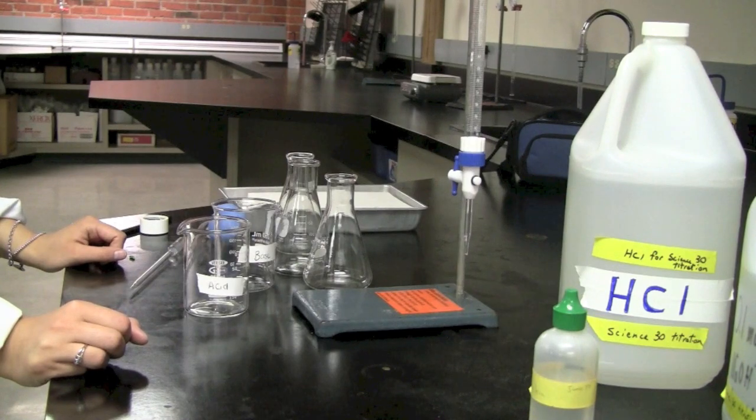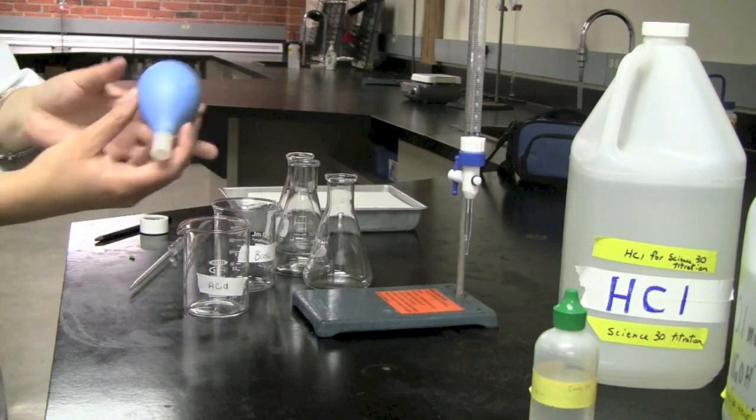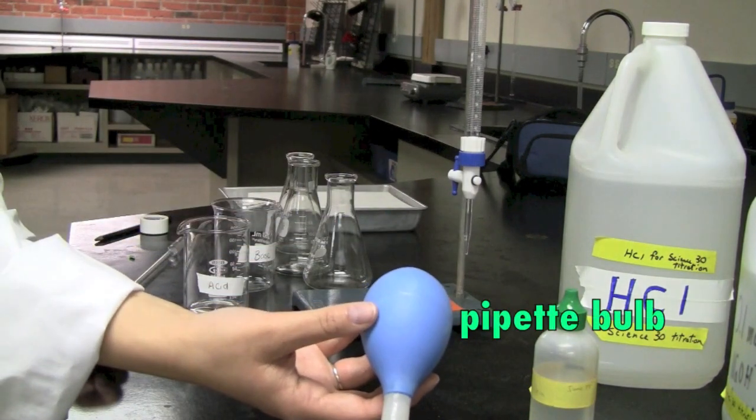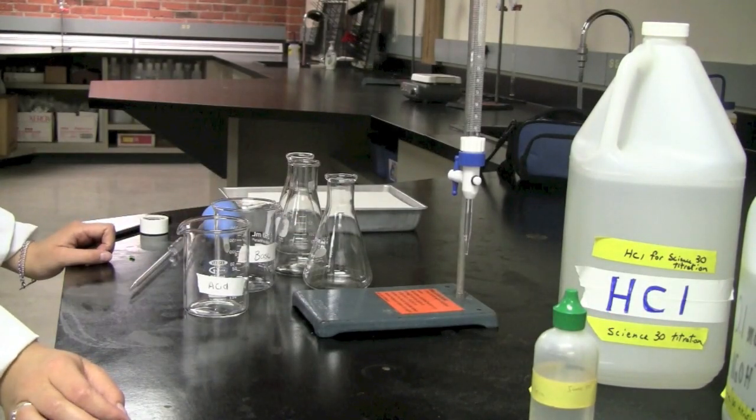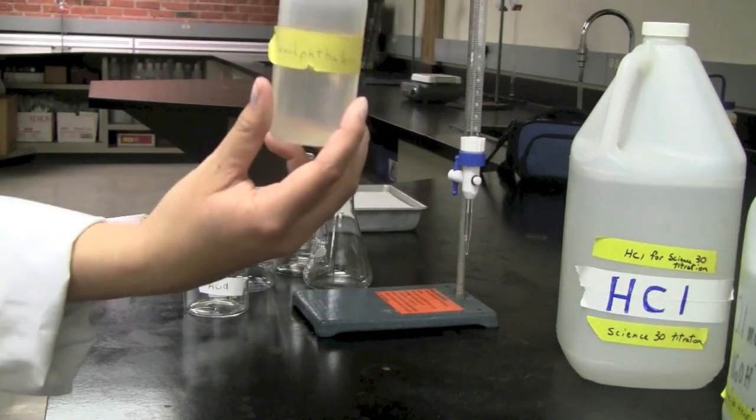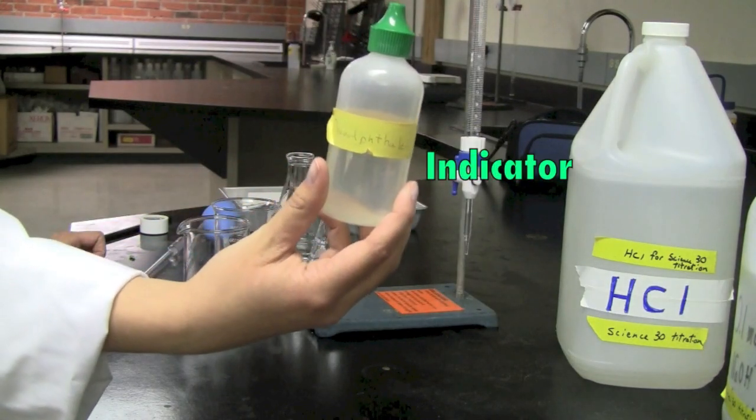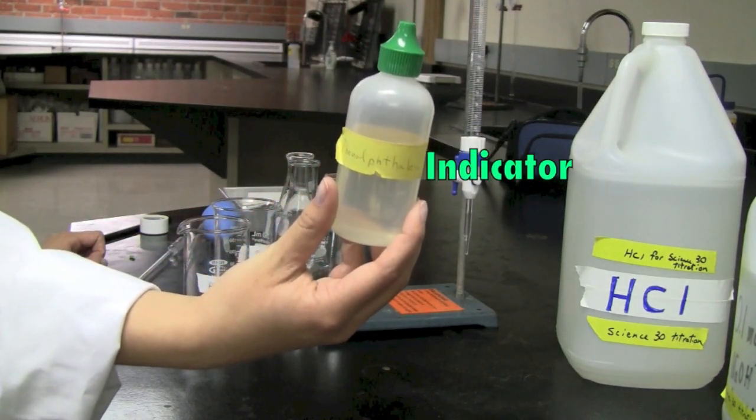And of course, we're going to need a pipette bulb to assist us with the work. As well, we're going to have something called phenolphthalein, which is an indicator that will give us a color change so that we can know if the base has been neutralized.